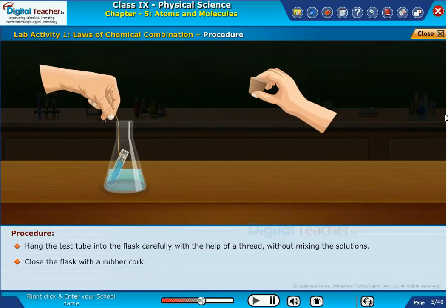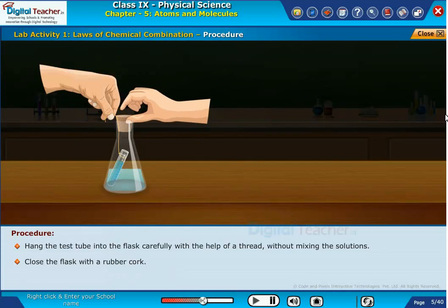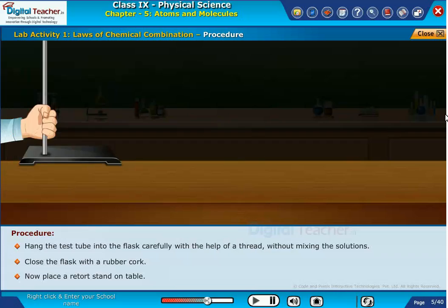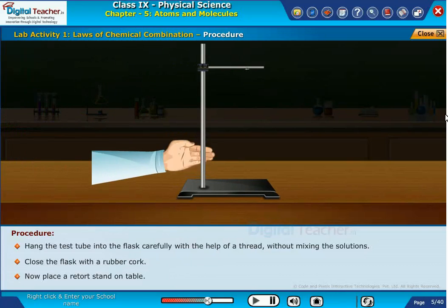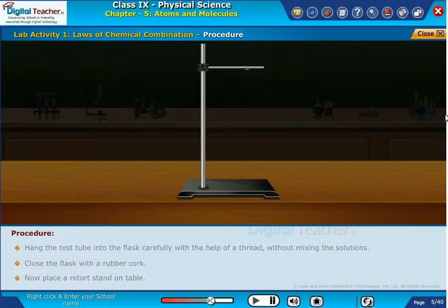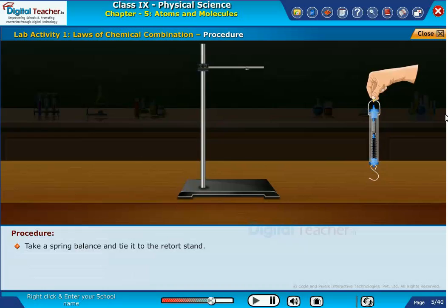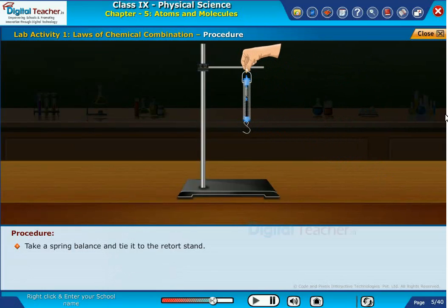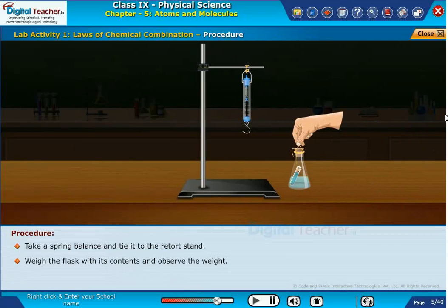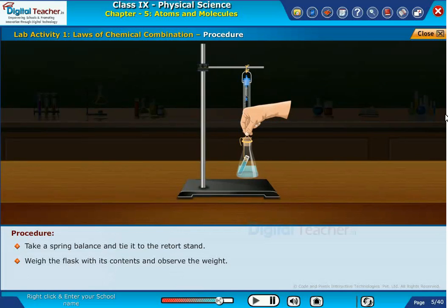Close the flask with a rubber cork. Now place a retort stand on the table. Take a spring balance and tie it to the retort stand. Weigh the flask with its contents and observe the weight.